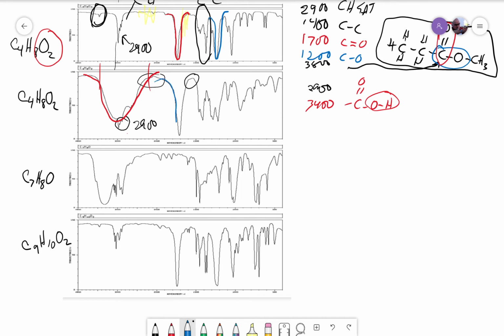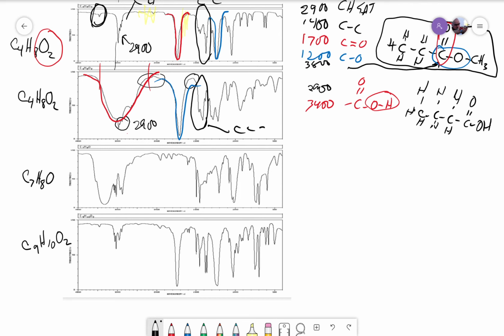And then here's the carbonyl. So I'm fairly safe in saying that this is a saturated carboxylic acid, and I can identify all of the peaks. There's a CC single bond peak. I can assign this to the CO peak, but you understand with resonance that's going to be an oddly shaped peak. The 1700 peak, of course, is the C double bond O.